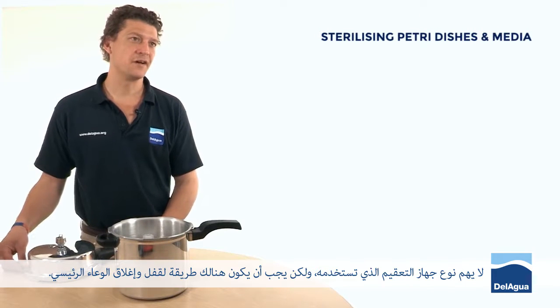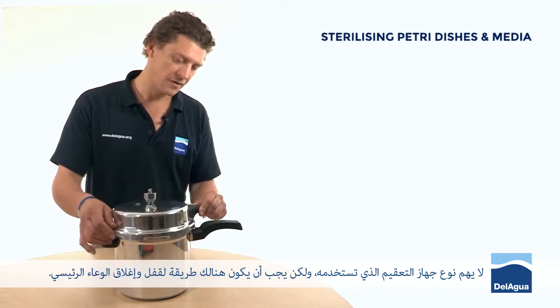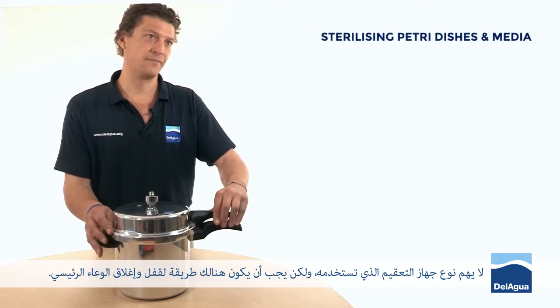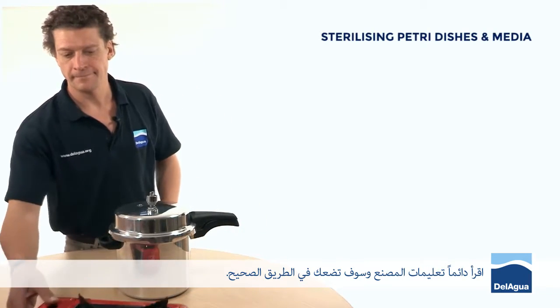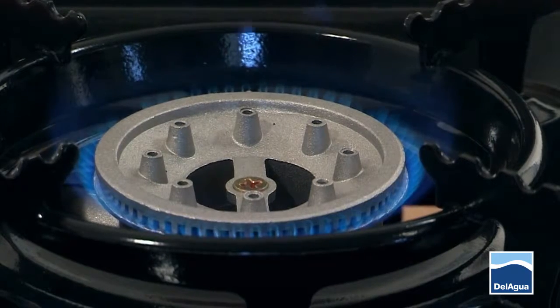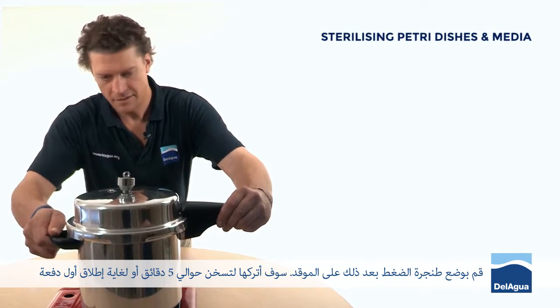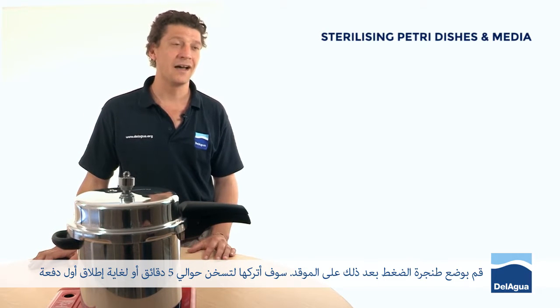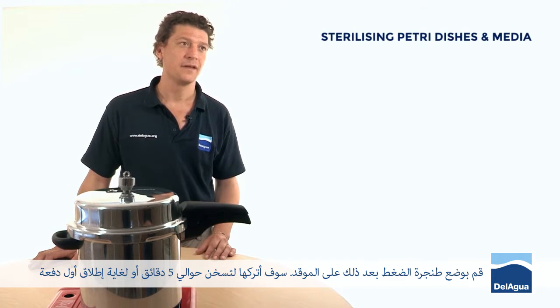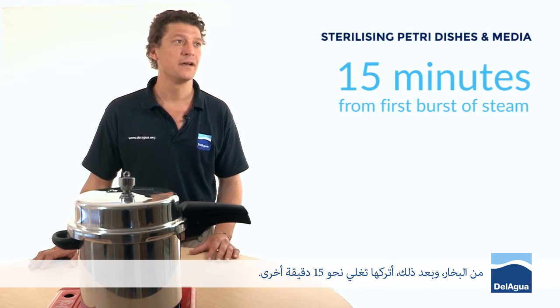It doesn't matter what type of sterilizer you're using, there is going to be a way to lock the top to the body of the main vessel. Always read the manufacturer's instructions and they'll point you in the right direction. I'll then place the pressure cooker onto the heat source. I'm going to allow it to come up to temperature for about five minutes or so, until it gives its first burst of steam, and then keep it on full power for another 15 minutes.